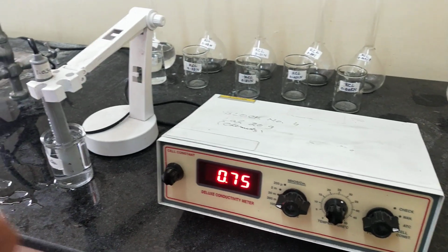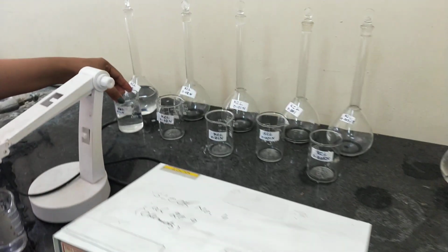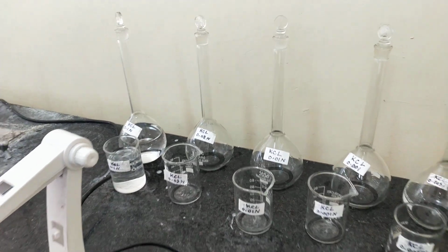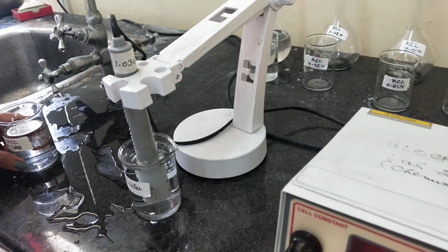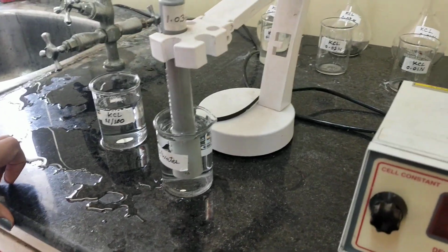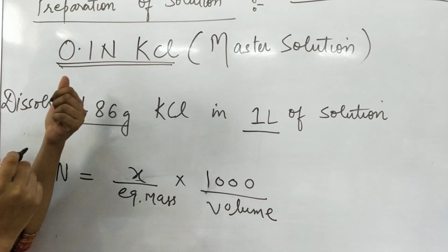Okay, to perform this experiment we need the beaker, we need a graduated flask to prepare the different concentrations, and we need distilled water. First of all, we will prepare our master solution. Here I will tell you how we can prepare the solutions.